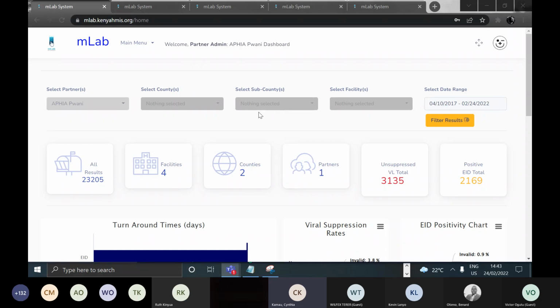The dashboard serves as a main point to show results and reports for people using IL and also for people using SMS. But if you're also using the app, you can also use it. So when you log in, the first thing that you will see is the dashboard. So the dashboard mostly has reports.